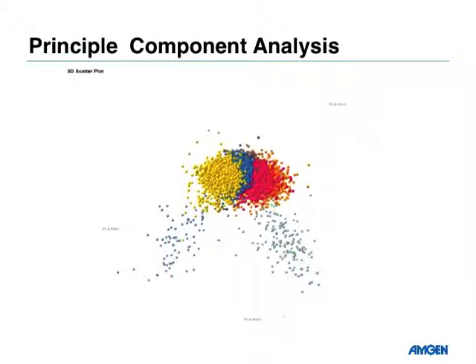The last part is using principal component analysis, which we've used a lot. With principal components, what it's really asking is, you have an initial set of variables, such as length, width, intensity. You take those measurements and make a linear transform of them, taking the things that produce the biggest difference in my population, and that will be my first principal component.